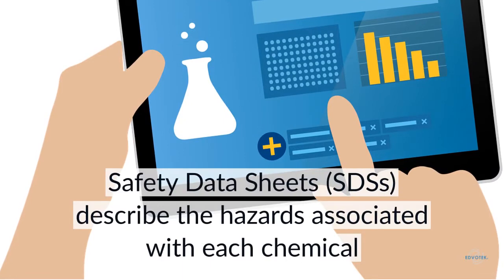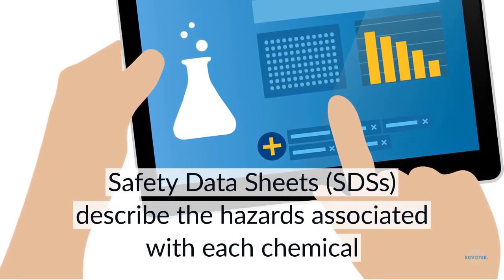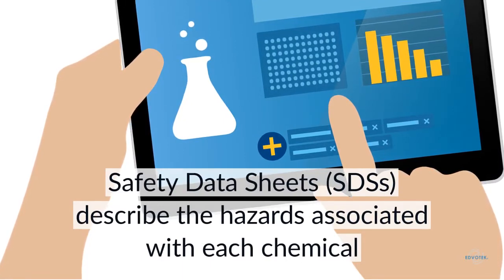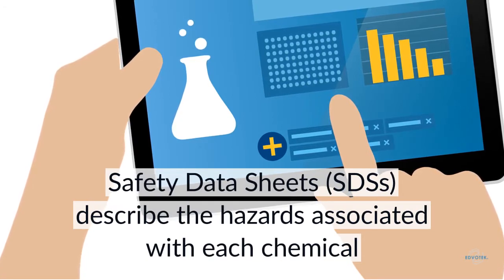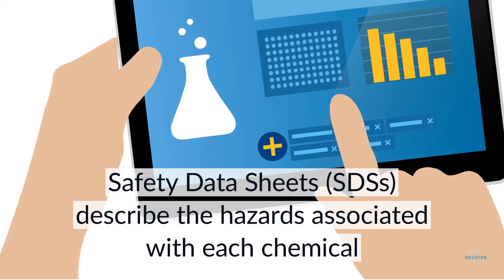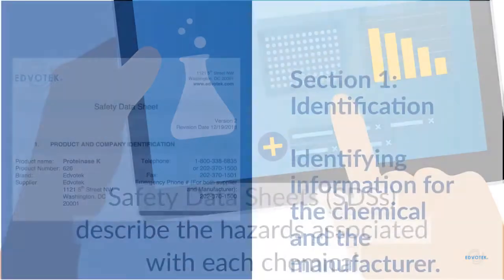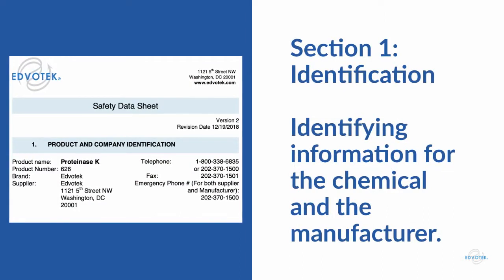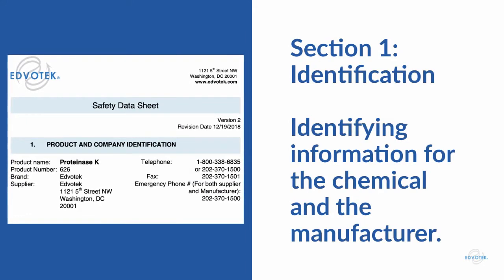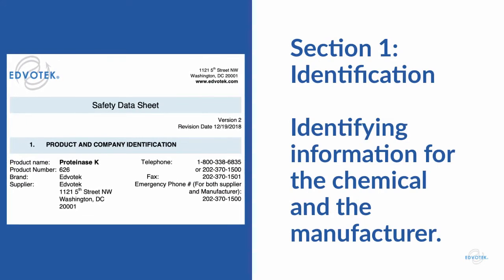Safety data sheets are comprehensive written documents that communicate the hazards associated with each product in depth. Each section of the SDS explains the hazards of the chemical products in a clear and concise manner. Section 1 includes identifying information for the chemical and the manufacturer, including the chemical's name and product number, and the manufacturer's name, address, and phone number.